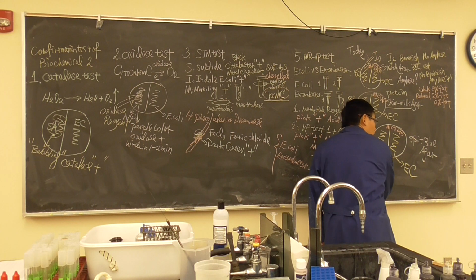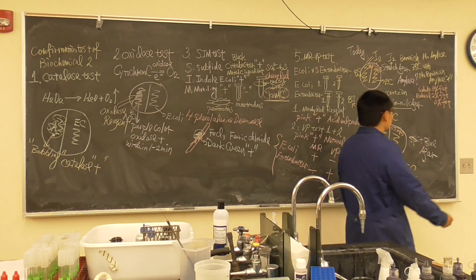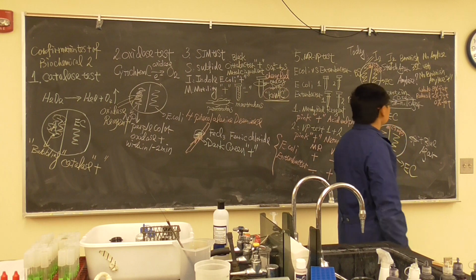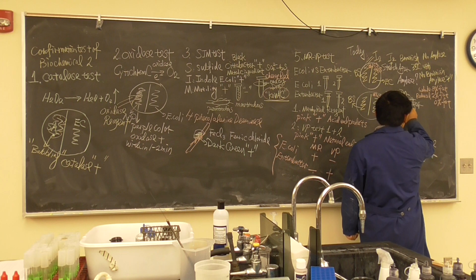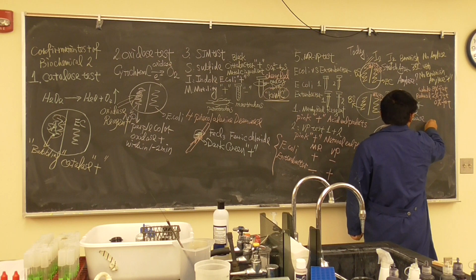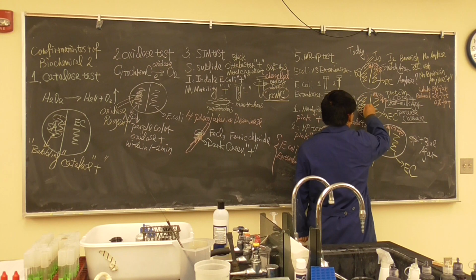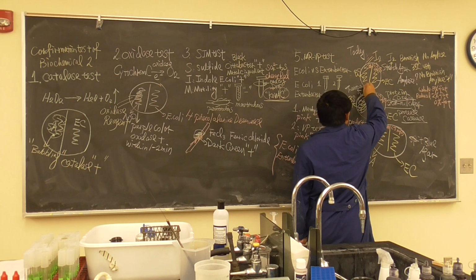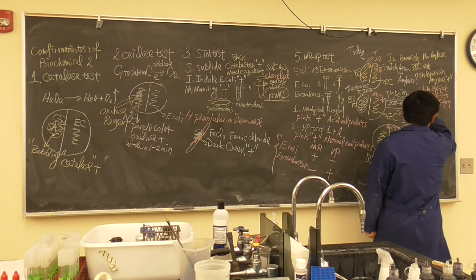What? Is lactose a protein or sugar? Okay, it's not lactose. It's called casein, is that right? So sometimes the bacteria can use protein if they have a protease. And in this case, it's casein. So how do we know it is positive? That's very simple. If you see a transparent zone. Okay, so this is a test of whether bacteria have protease to break down casein.